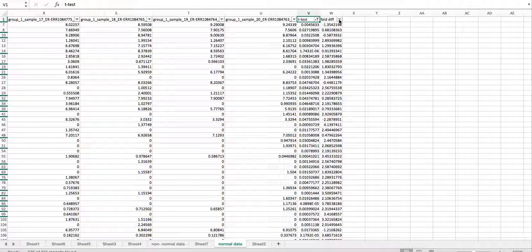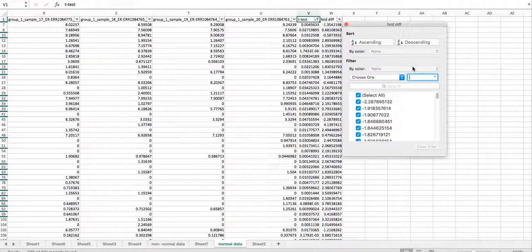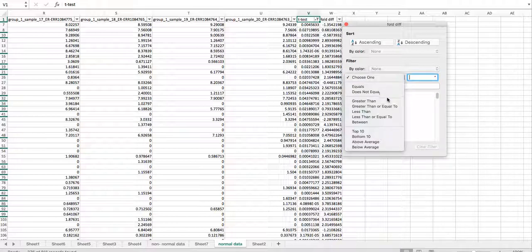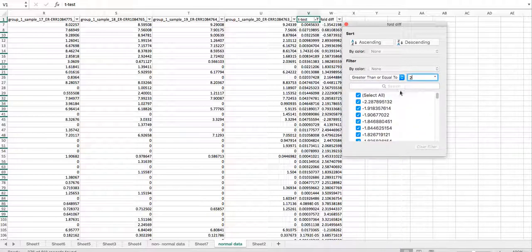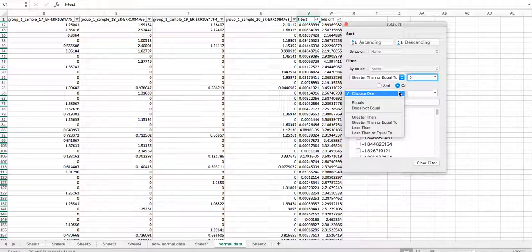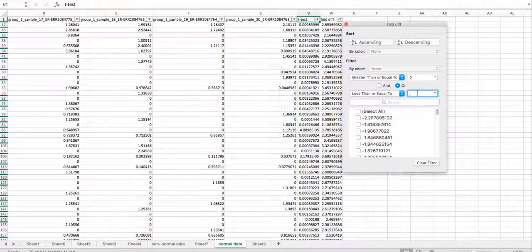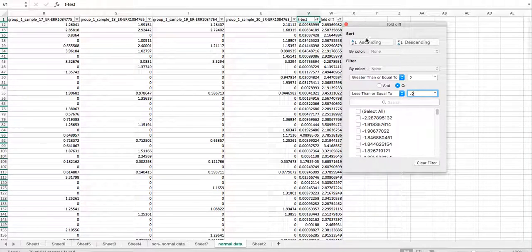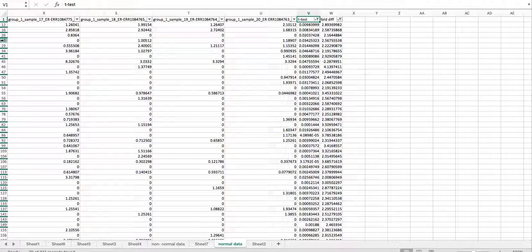We're also interested in having a fold difference of greater than or equal to 2, or less than or equal to negative 2. And that's what we see here. Over on the left, these are the rows of genes that meet both of these requirements. We have a subset, and that's how you would analyze these results using traditional methods.